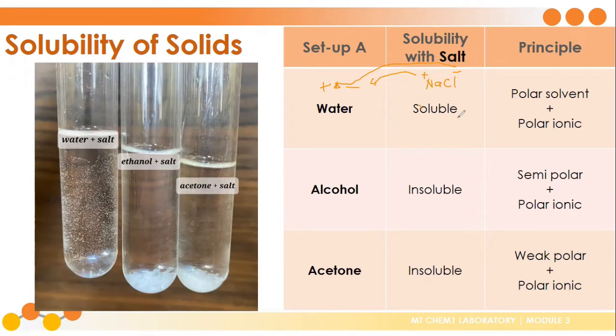We also have to remember that we are following the concept of like dissolves like. Since water is considered a polar solvent and it is combined with a polar ionic solute, which is your salt, it will be soluble. And as you can see in this one, there are minimal salt granules, but most of them dissolved. Maybe upon a bit of stirring, it will be further dissolved.